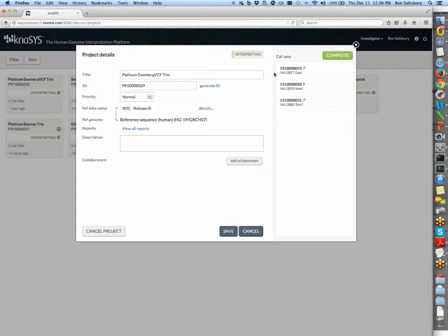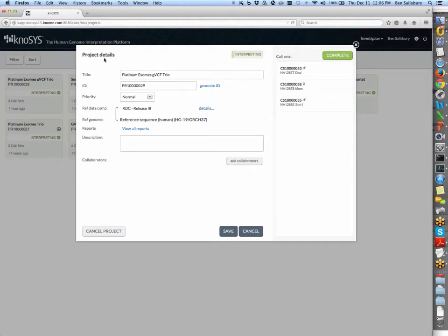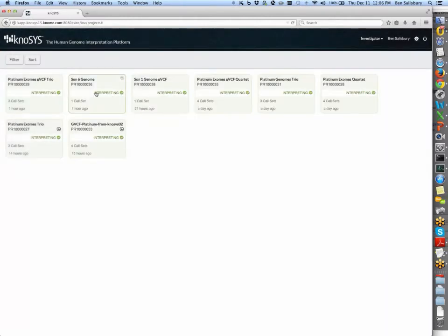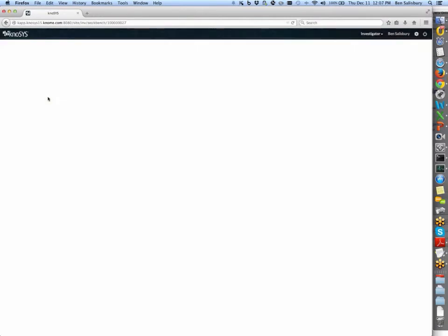So there's no particular phenotypic trait that's being analyzed here or expected to find, but it's a versatile set of sequences to try things out with. So here we have a list of the annotations that were applied to this particular project. And having reviewed this, we can now cancel out of this, and I'm just going to open it up. So it's now loading these 3 exomes into memory.